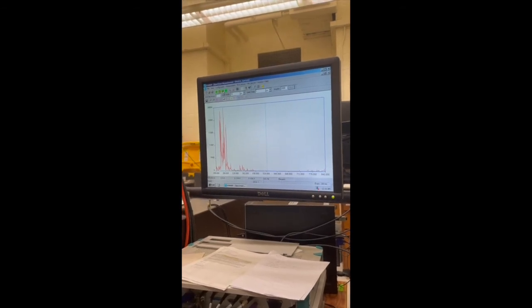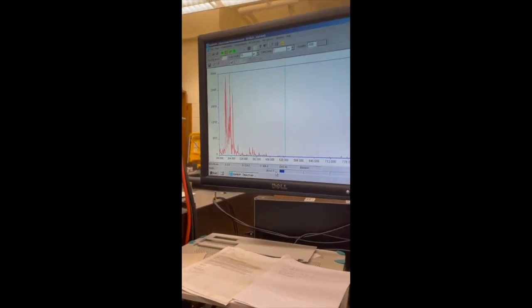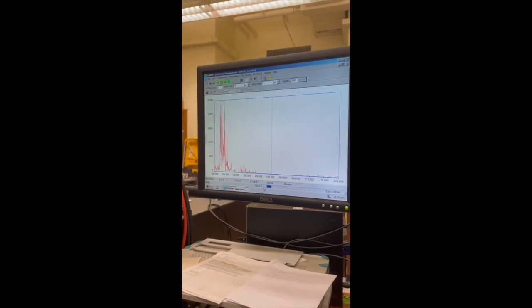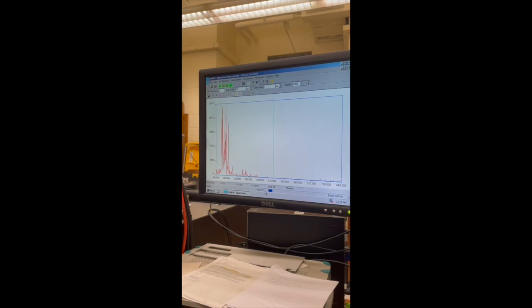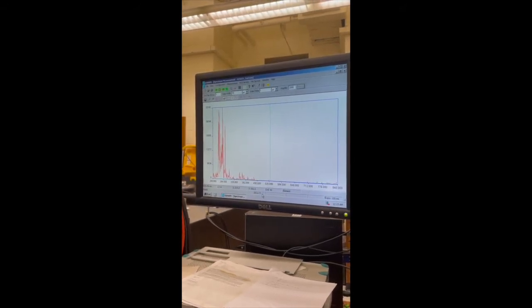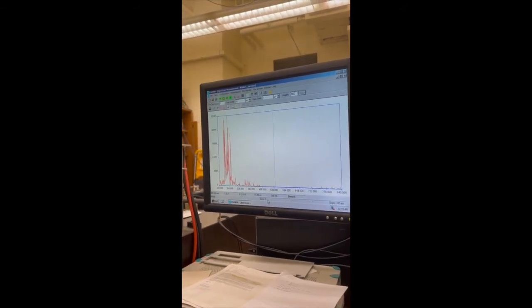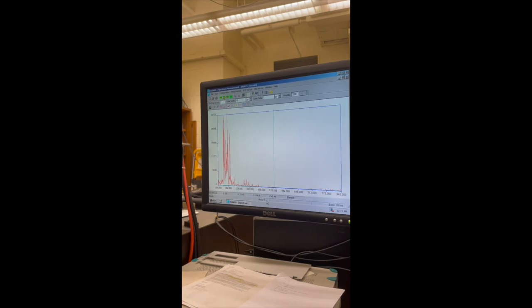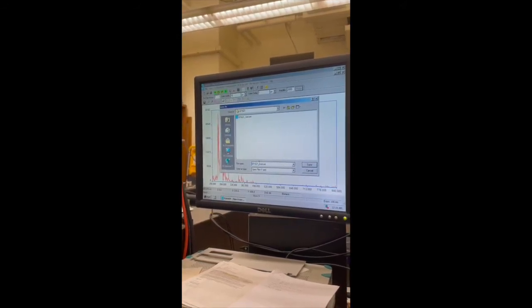And if you look at the bottom of the screen where it says ACCU, see how that's updating? So that's telling you how many shots are being acquired. And of course we set it to 5, so it will stop at 5. And there you go. And the important thing to remember about the ESA software is it does not save on its own after taking data. You need to remember to hit that floppy disk button and save that spectrum.